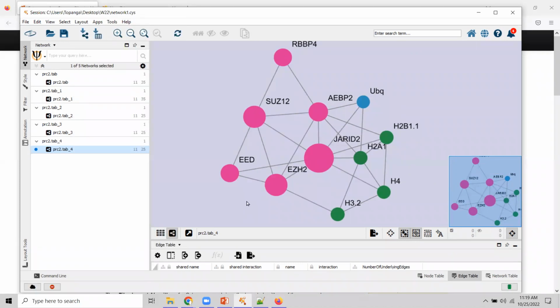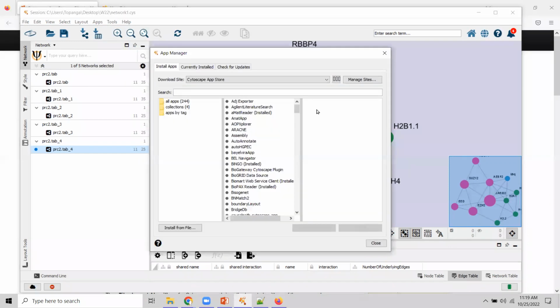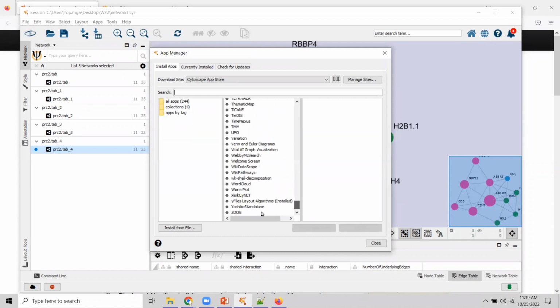Yeah, so you can download. This is another version I've seen. This is, I think, what happens on Macs and on Linux. Then you download it into a file. And then once you're there, you go to apps. In App Manager, there's gonna be down somewhere here, Y files here. And then you're gonna have to install from file and point to the file that you downloaded. And it should do the same thing.